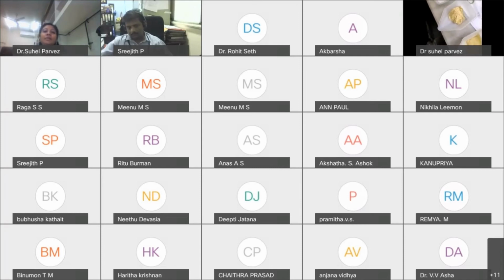So it's actually a recipe like we are making a food, not like those used in bacterial culture and other culture media. The vial of the food media looks like this. This is how the food color looks after solidification, and we maintain the culture in glass vials and bottles like this. The flies need to be transferred every week into new culture vials or bottles to steadily maintain the flies in the lab.